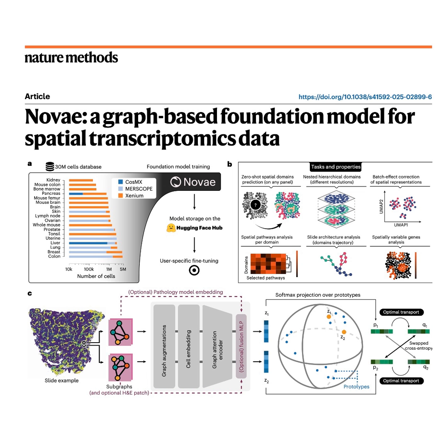But is it looking at the entire tissue section at once? Because those can be huge. No, and this is absolutely fundamental to Novae's success. We immediately truncate any edges that are longer than 80 microns. Novae focuses intensely on the local microenvironment. Okay. It works by sampling small subgraphs, usually between 15 to 80 cells, based only on those nearby connections.